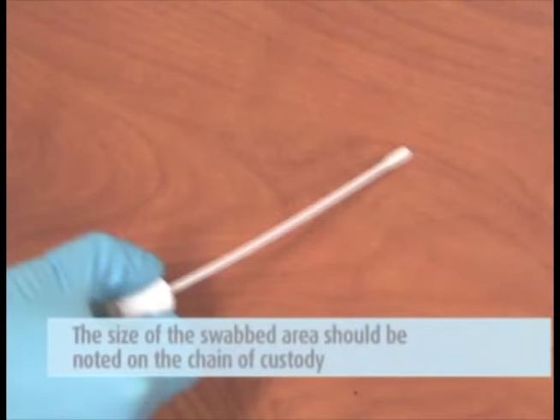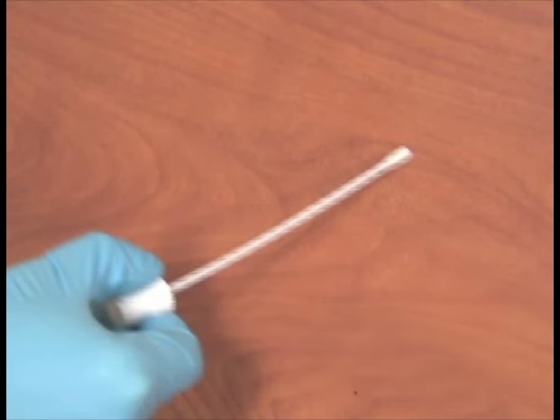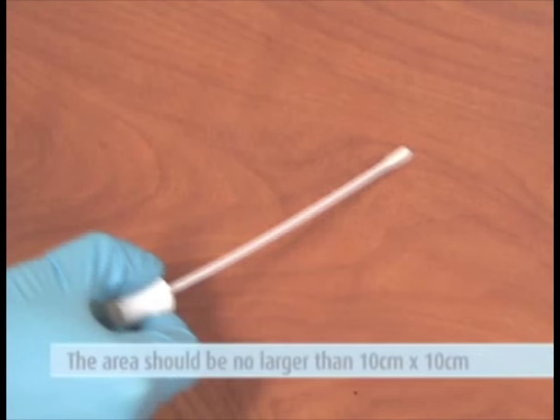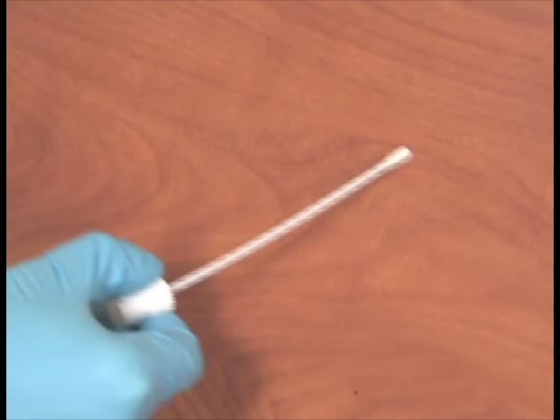The size of the swabbed area should be noted on the chain of custody. If a viable analysis is requested, a measure of CFUs per square centimeter can be obtained from this information. The area should be no larger than 10 centimeters by 10 centimeters, or roughly 4 inches by 4 inches, as too large an area may provide inaccurate data.